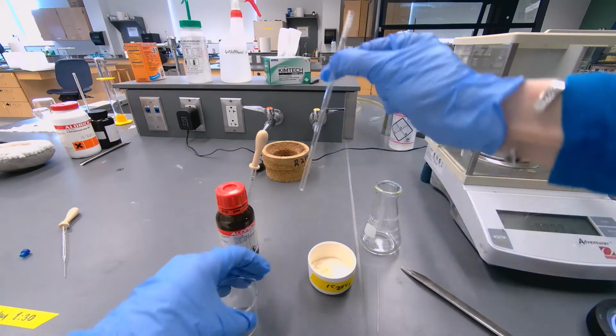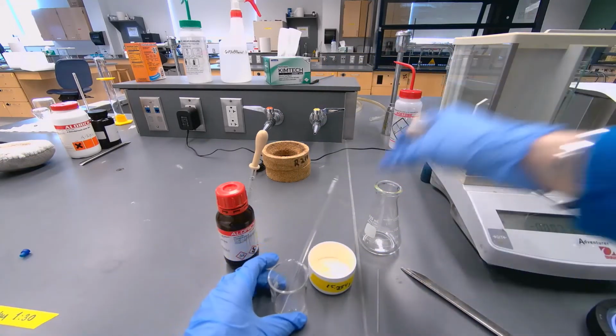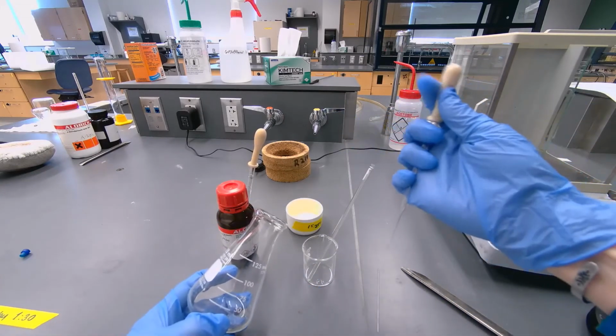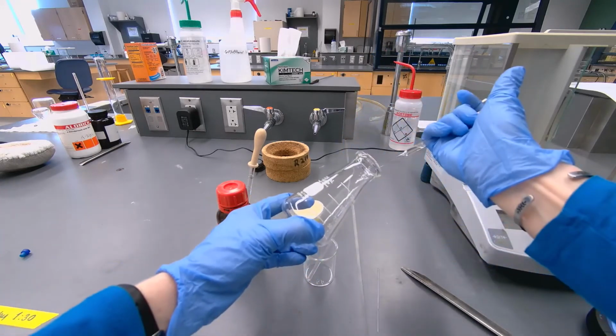And then I have an NMR tube, just propping it up. Use a clean pipette to suck up my solution. It helps to grab it like this, and get that into the NMR tube.